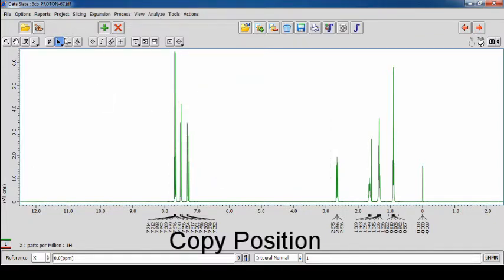In the drop menu, there is Copy Area and Copy Amplitude. Copy Area creates a box when clicked and dragged and allows you to measure the area you cover with markers on the X and the Y axis. Holding the Shift key will limit the box to a square. Copy Amplitude performs the function of copy position but for the Y axis instead. Holding the Shift key will lock the cursor to the data, allowing for accurate intensity recording.